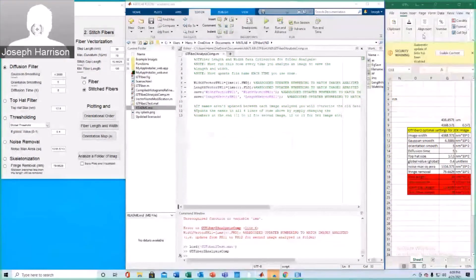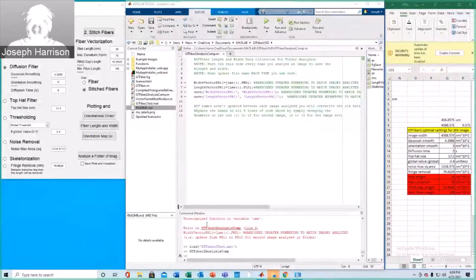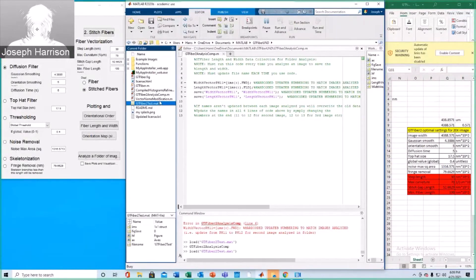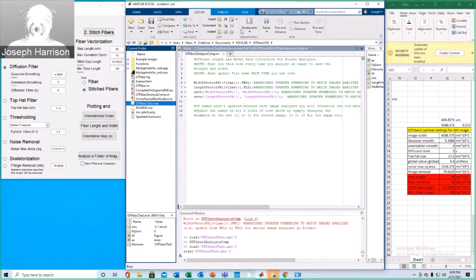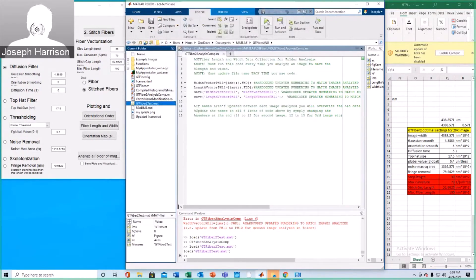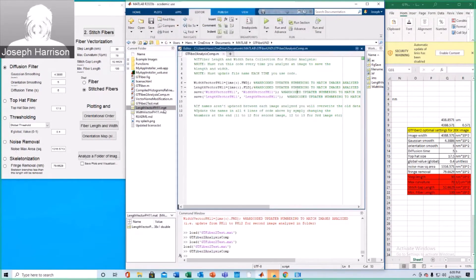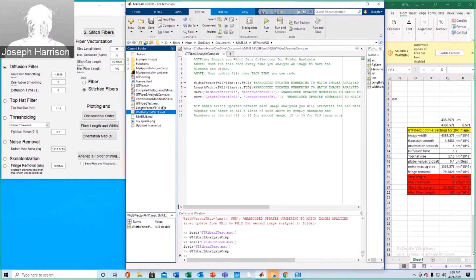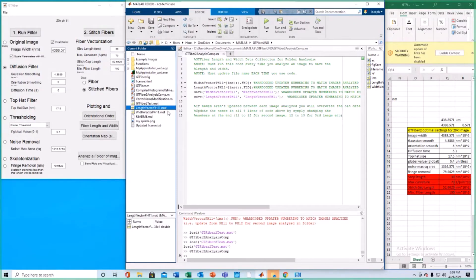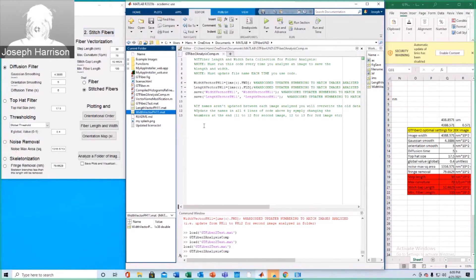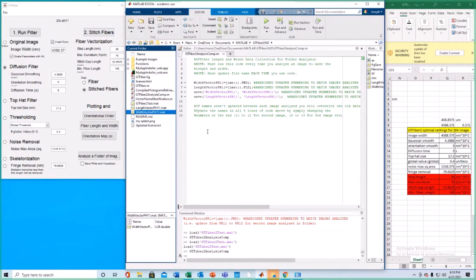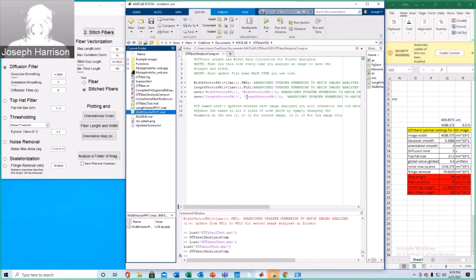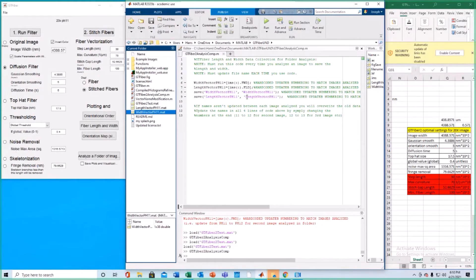Okay, so we previously ran into this error, unrecognized function or variable IMS. Make sure to click on this structure, and then now you should be able to run it, and it will extract the appropriate length and width vectors associated with the image. And these essentially contain all of the lengths and all of the widths of the fibers detected by the fiber stitching process and the filtering process. And it's very important to note that yes, you do need to hard-code these image names in.